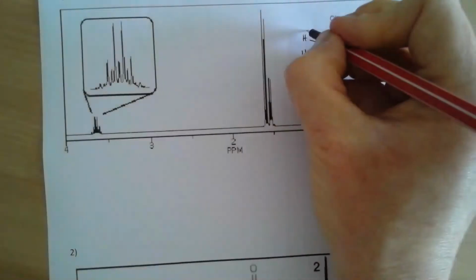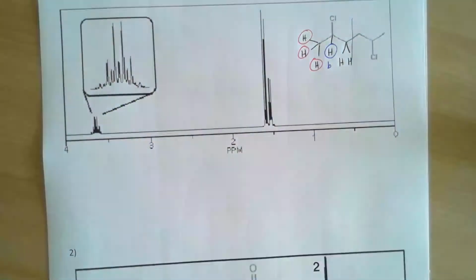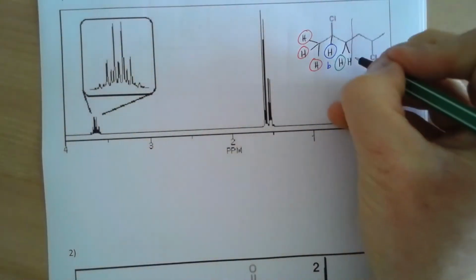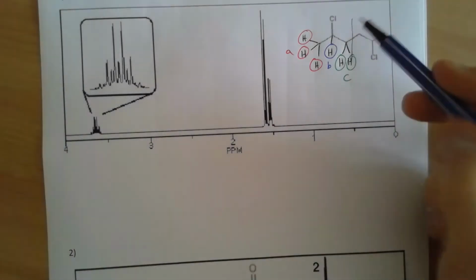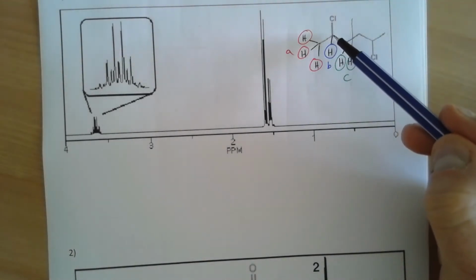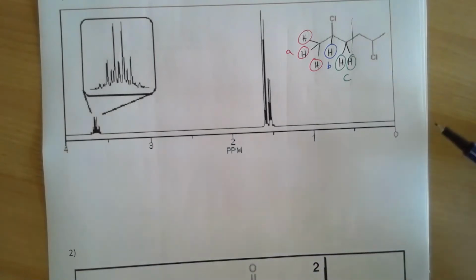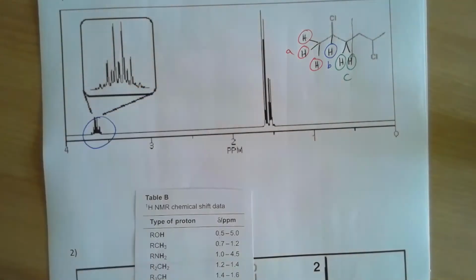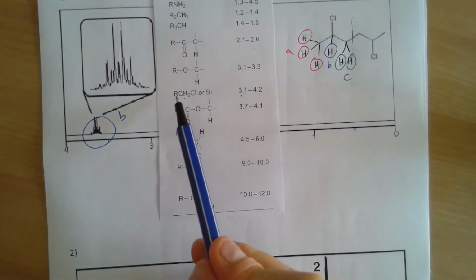So if I was going to label each of my 3 environments, I would label that as the red environment, or environment A. This is environment B, and then these 2 as environment C. Just looking at this spectrum, we could make a really good prediction early on about where we would expect to see this compared to these two. This hydrogen is attached to a carbon that's attached to an electronegative atom, the chlorine atom, so we're expecting to see this quite de-shielded. We're expecting to see it quite far down field. So it'll be a very, very good prediction to say that that is environment B. And if we have a look at our data sheet, in fact that is correct.